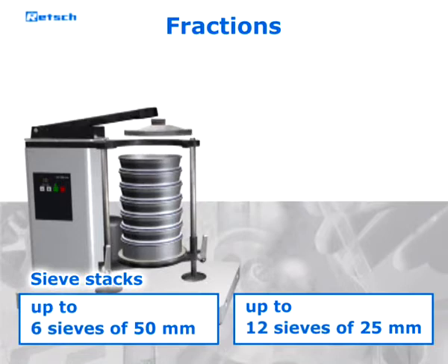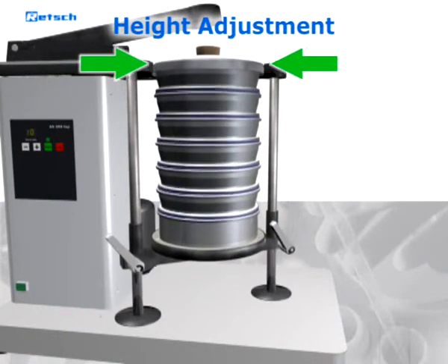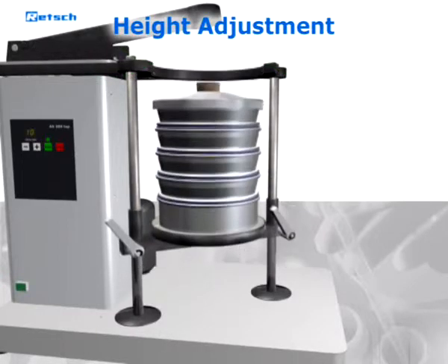The sieve stack is simply placed on the vertically adjustable sieve plate. To adjust the height, the clamp bolts are loosened and fixed again in the desired position. Thus, an adjustment to the different sieve stack heights can be realized quickly and easily.